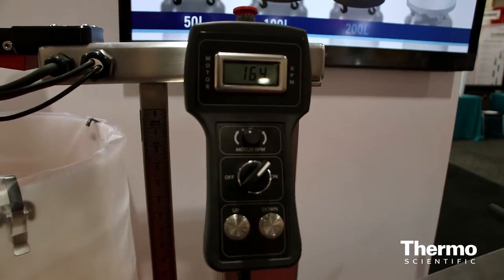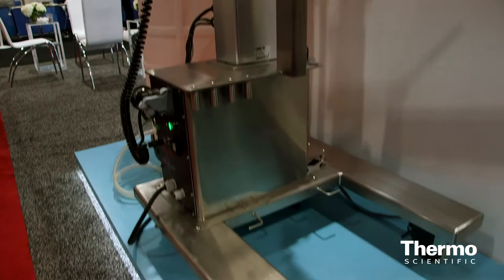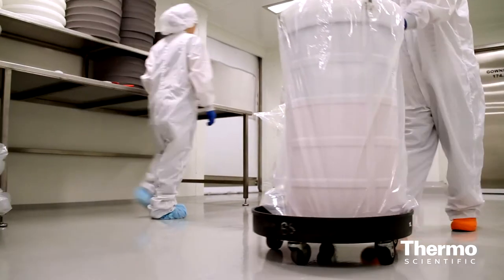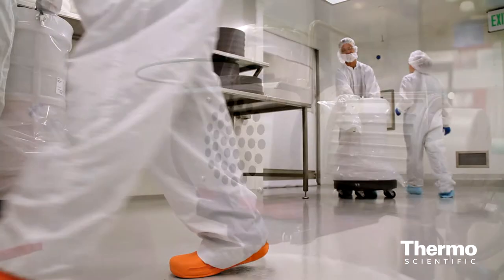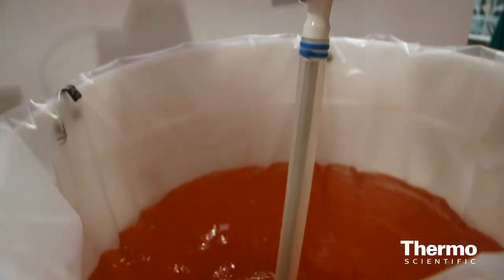It has a tethered handheld device for adjusting the speed of the mixing. This can be moved around the facility into different labs. You can use four different drum sizes with the product. Customers can look at mixing different volumes and they can also operate that at a five to one turndown ratio.